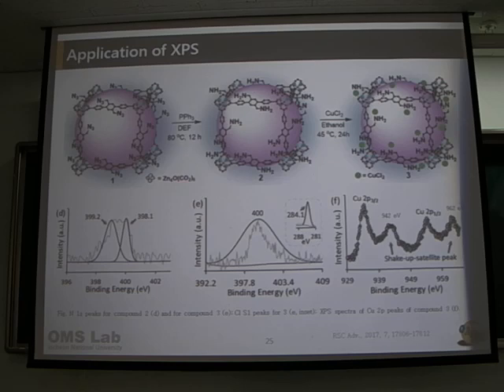Yeah, degradation of the copper mainly. Copper degradation of metal. What temperature? The metal does not degrade after modification with the metal. So what kind of degradation are you looking at from TGA?